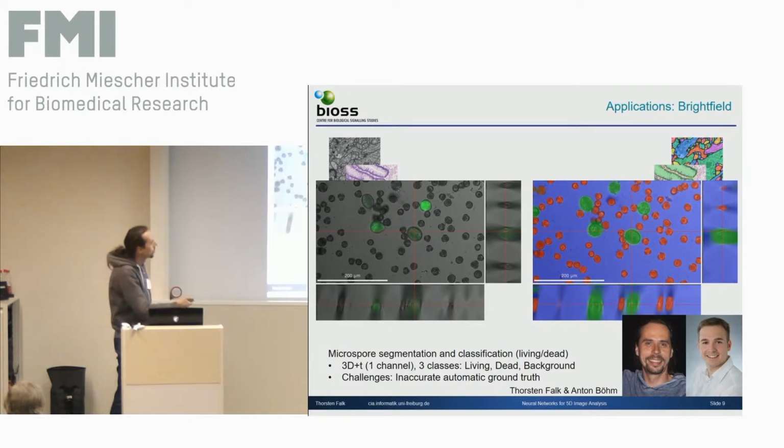Right, what you also can see, it is bright field data. So, well, segmentation in Z direction is not very nice. Actually, we can do better. We are just preparing a paper where we can show that we can even, from bright field data, get quite crisp boundaries, also in Z direction.